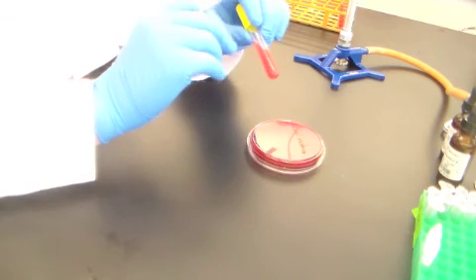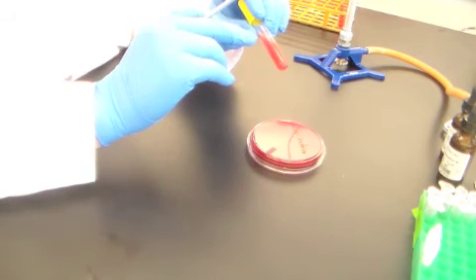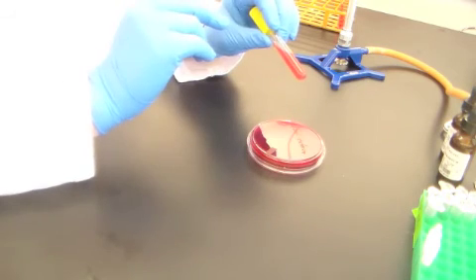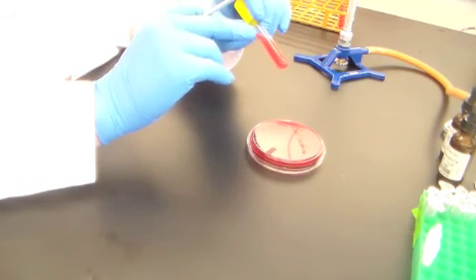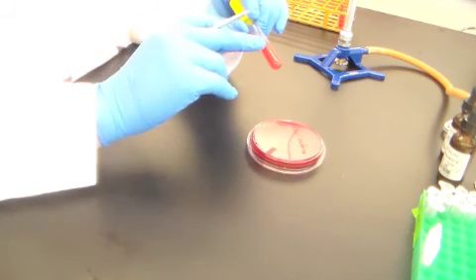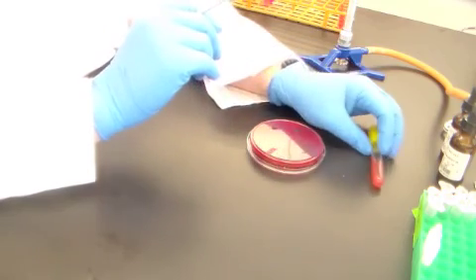And we'll talk more about the specifics of this media. I'm going to post under week 6's folder, along with this video, some PDFs, one of which will deal with the triple sugar iron agar. This is a complex media. There's a lot of information that can be gained from this, so it's going to be very important for you in terms of your unknowns and in terms of the lab practical that you understand this media very, very well.